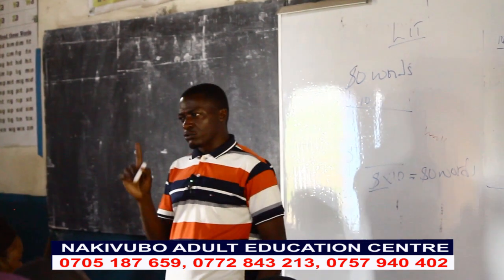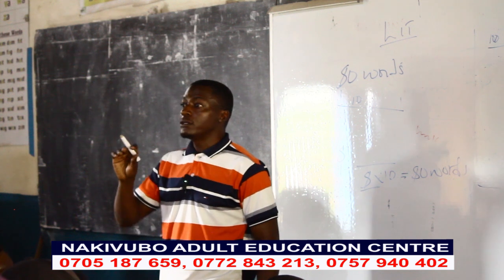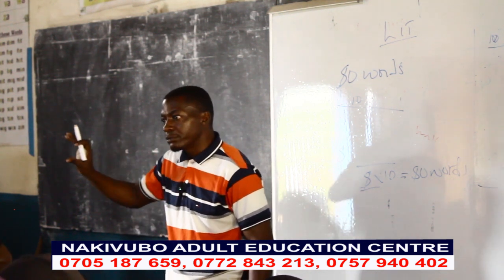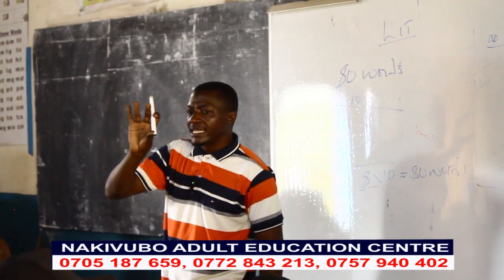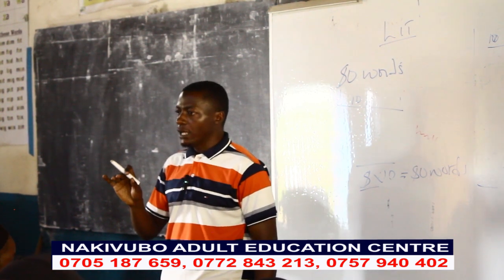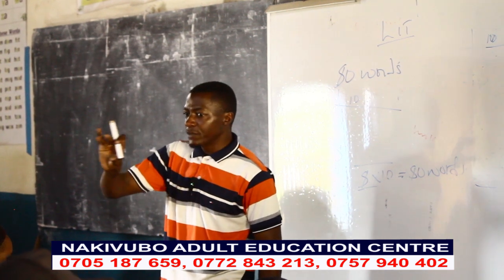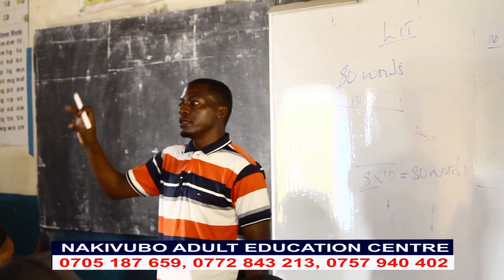Every gas which is produced has a test. For example, if I want to test oxygen, what do we use? A glowing splint. Have you ever heard of it? Yes. Oxygen relights a glowing splint. If I'm testing hydrogen gas, I use a burning splint. Hydrogen burns with a popping sound.